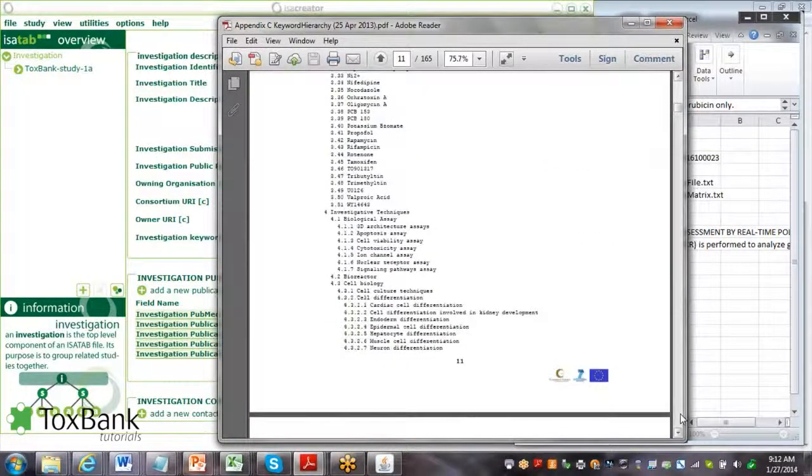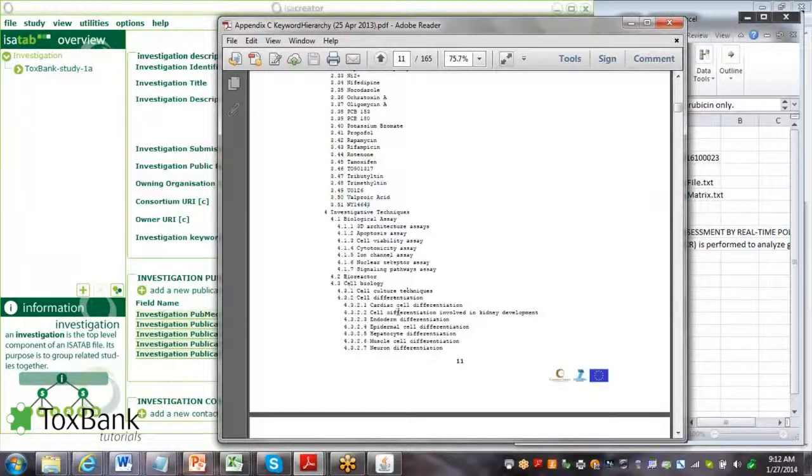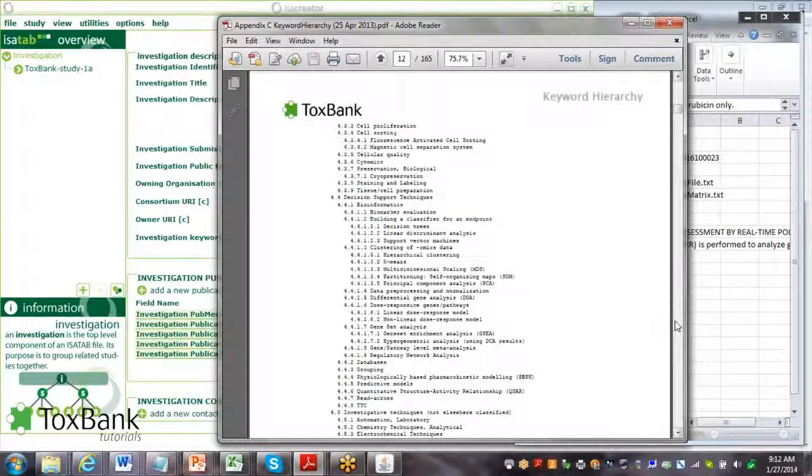The next section is investigation techniques, such as different cell biology techniques or informatics techniques.